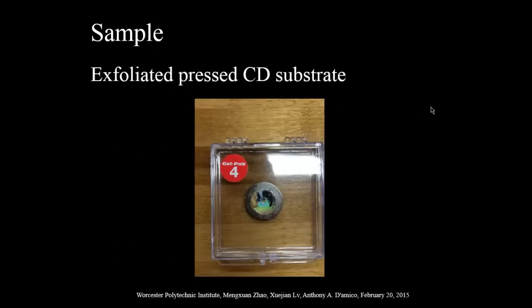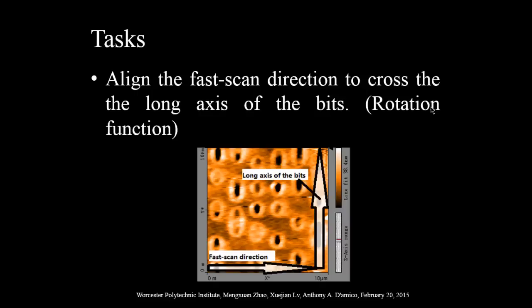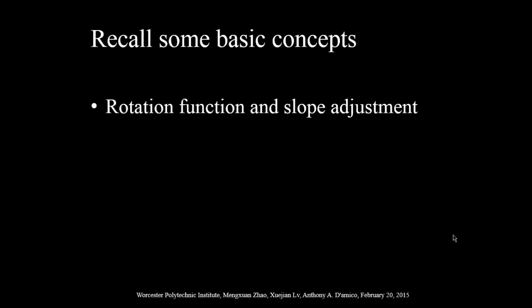This is the sample for Instrument Lab 3. It is an exfoliated pressed CD. The aluminum on the surface is not completely exfoliated. If you scan the image, you will see discrete bits in your image, like this. Align the fast scan direction across the long axis of the bits. To achieve this, you should use the rotation function, which you learned in Instrument Lab 2.